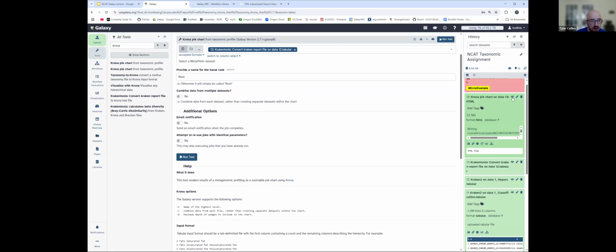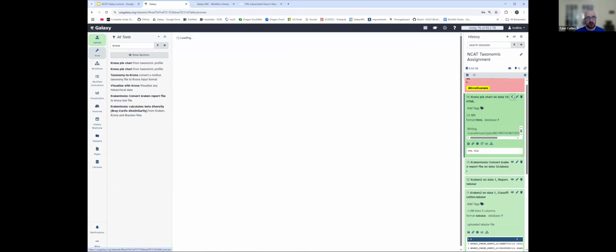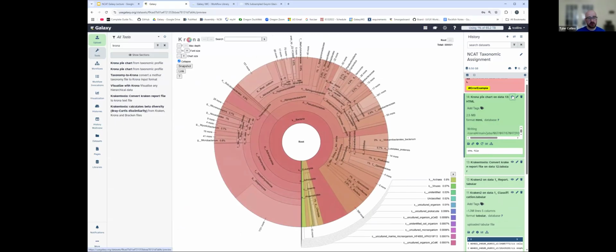It's at this point that we'll actually get a better feel for our data and our taxonomy. When we run it, we convert that long, multiple millions of line file into this really cool interactive chart that essentially allows us to move between those kingdoms, phyla, clades, and look for more interesting things. Additionally, we can take snapshots if we want to save things, to have it be easily exported or moved, and adjust a few things.